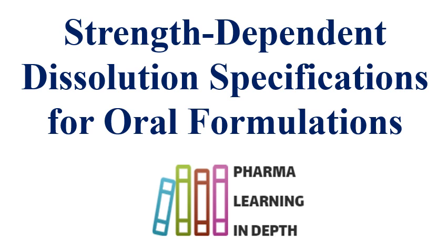For example, if you perform dissolution of a 1000 mg tablet of, let's say, metformin, it will have some release profile.